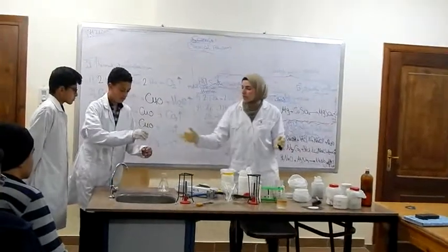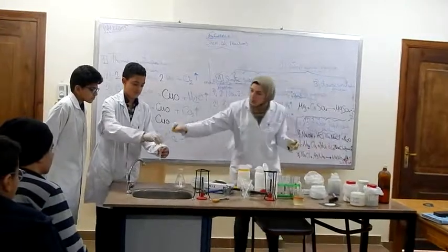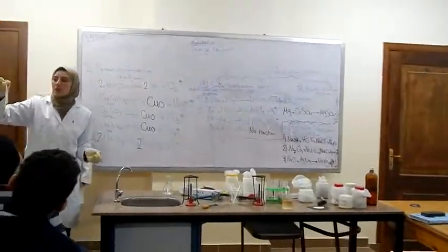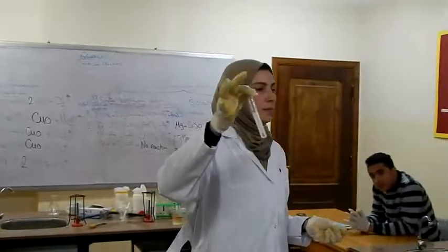A white precipitate is formed. Silver chloride is formed. This is the last activity.